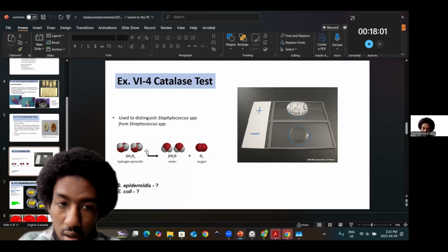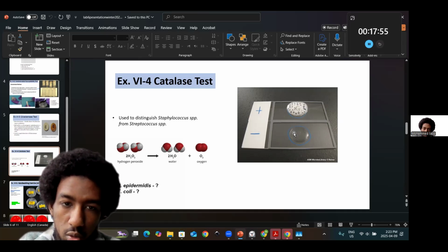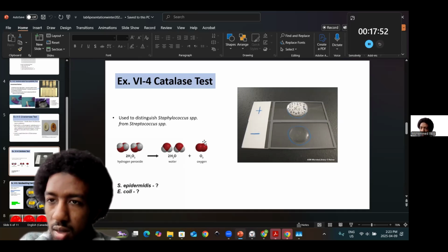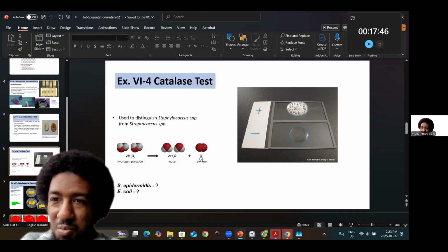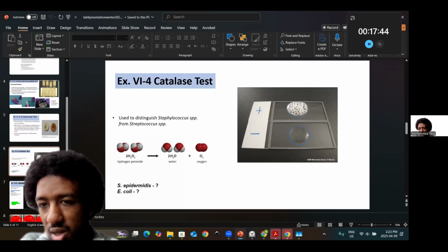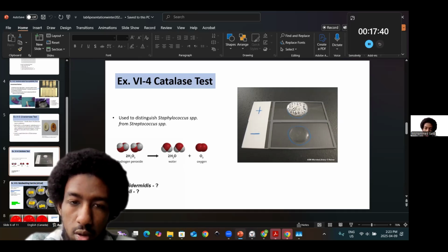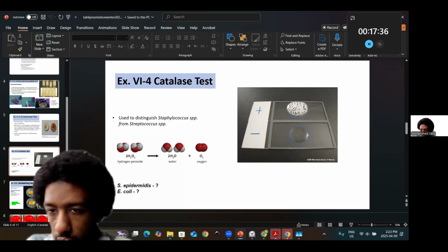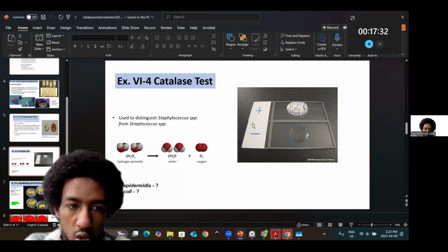This is because of the reaction where you have a few drops of hydrogen peroxide, I believe 2%, or nonetheless the fixed percent that you have, that would increase the oxygen production, which are these bubbles that you see from your group of bacteria. So bear in mind that you would follow the steps that you recall from the past, right? This would be a liquid inoculation of your bacteria.